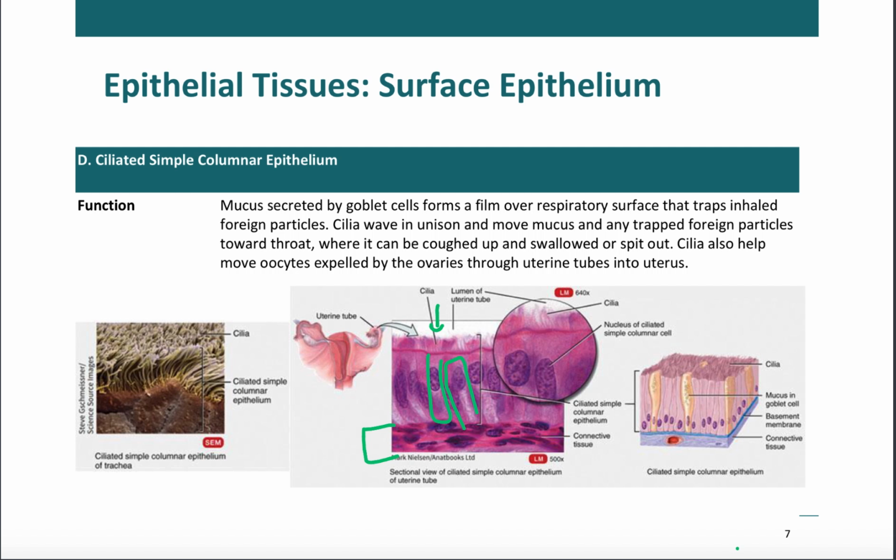So remember, epithelial tissue is often on top of something else. Sometimes there'll be a layer underneath of it that doesn't look like the main layer. But again, you want to focus on the section that looks like it's part of one form of tissue, and don't worry about the weird random stuff underneath of it. If it clearly looks like a completely different section, then you can treat it like that.